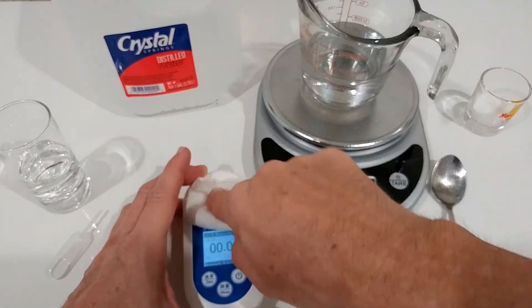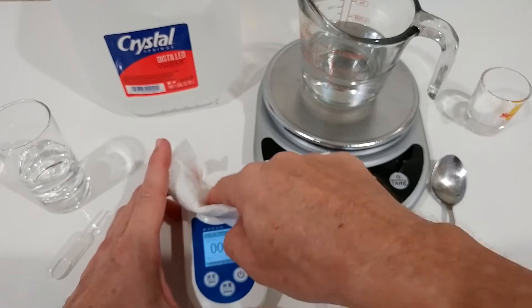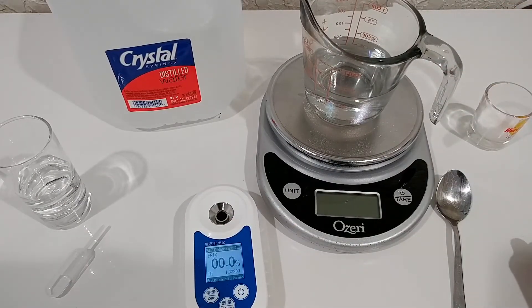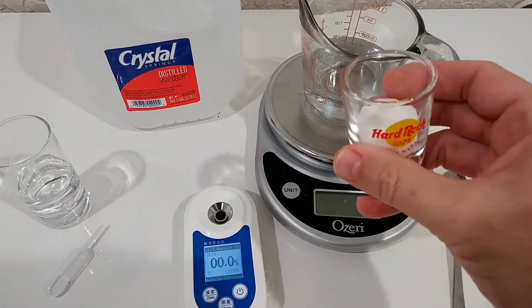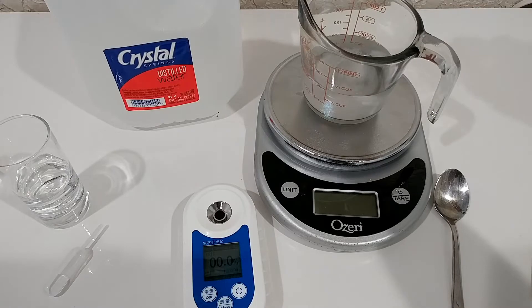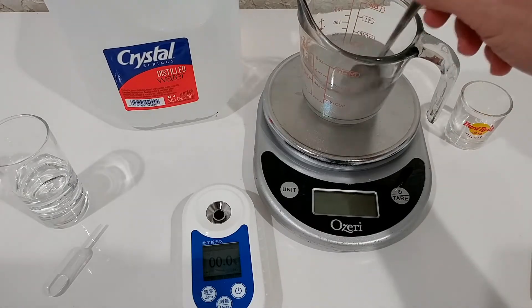We clean and dry the prism. Now I have 100 milliliters of normal filtered water and 10 grams of normal sugar. I'm adding the sugar and going to stir it for a while to let it properly dissolve.